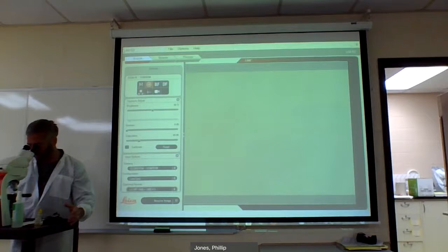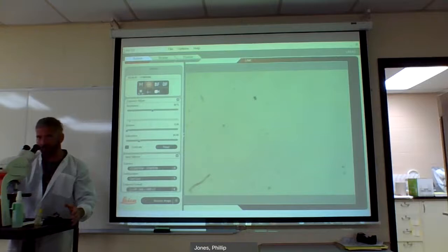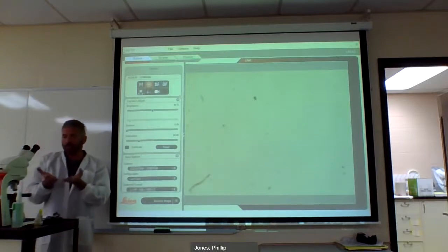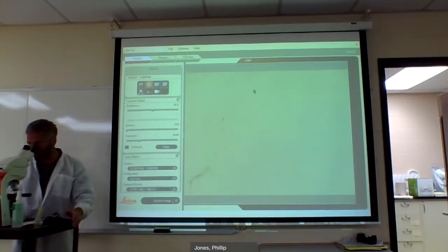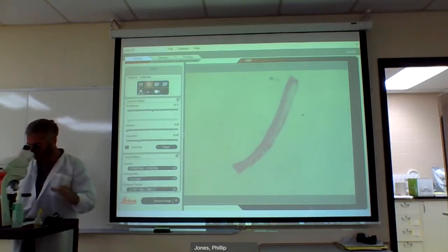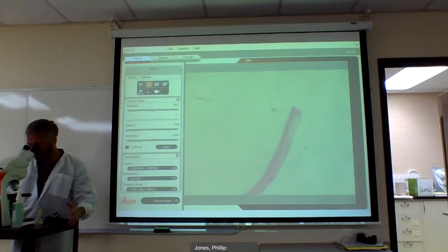If I take it out of focus and move the slide back and forth and nothing really changes, I know something's not right. I'm going to use the coarse focus now. As you move the knob away from you, it should come up. If you can't get it in focus, you generally want the stage as close to the objective lens as you can. We're moving it back and forth — can we all agree we see something there? Looks like a strip of bacon.